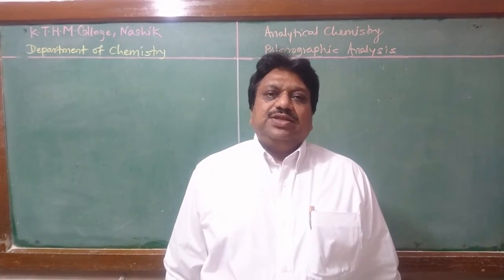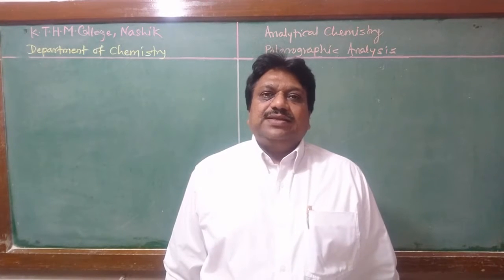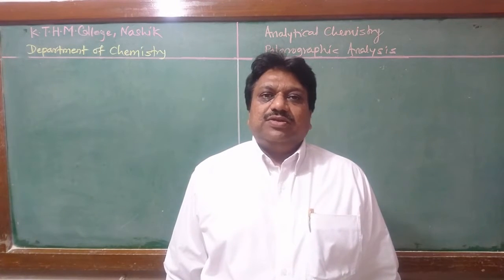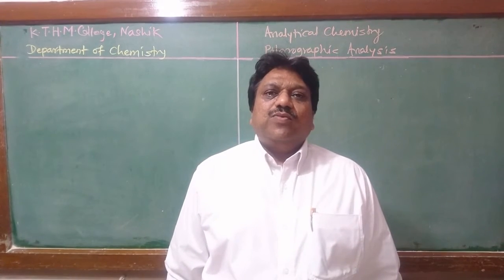Student, in the previous lecture we discussed the instrumentation of polarography, that is, the apparatus used in polarographic analysis. Today we discuss the working of polarography.